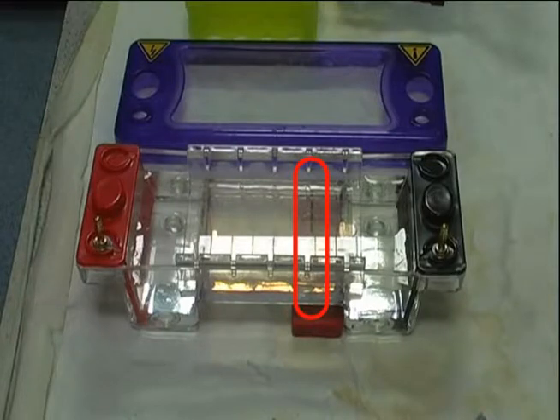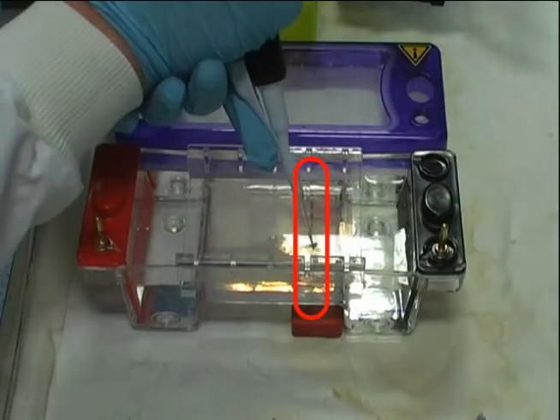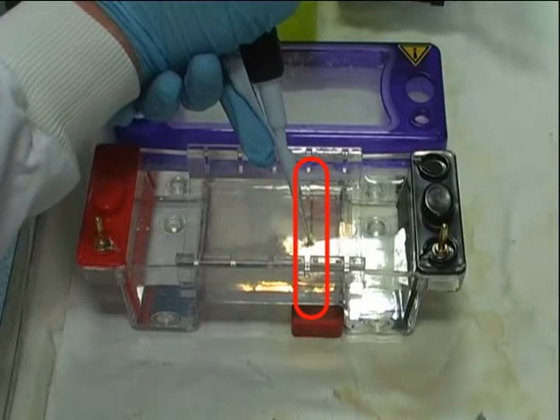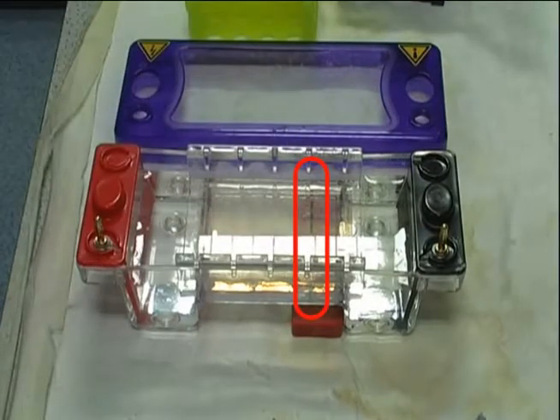Once the gel has been fully loaded with the sample DNA from the thermocycler, the power supply is attached and a current is passed across the electrophoresis unit to allow the DNA to separate as previously discussed.